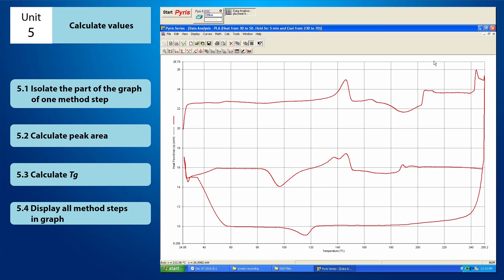Hello everyone! Welcome back! This is a tutorial video on how to calculate the values of the graph on the instrument viewer.